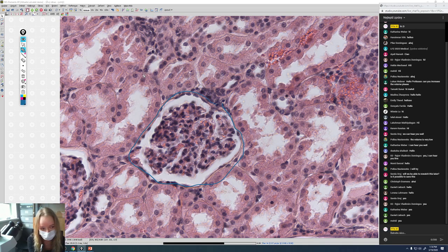But if you know right now, they are tubules of the nephron. So you know from the renal bodies there is some tubular system, and these structures around the renal corpuscle are tubules of the nephron, right here around. Okay, so let's go back to the renal corpuscle, the renal body itself.